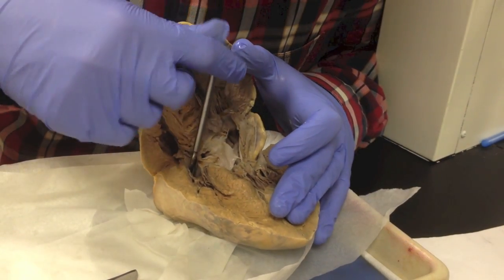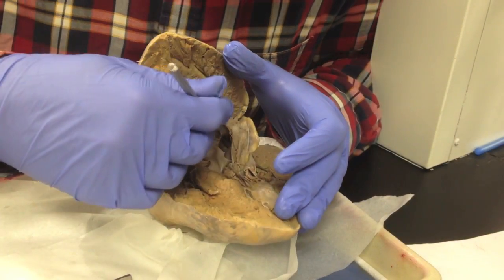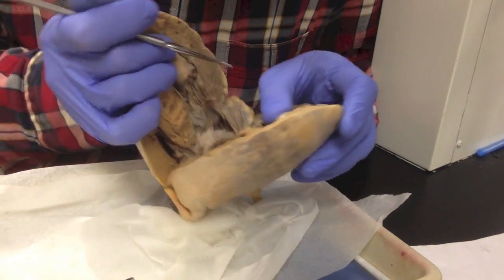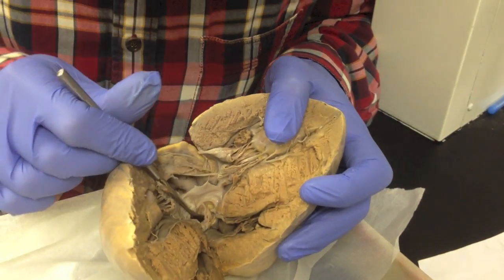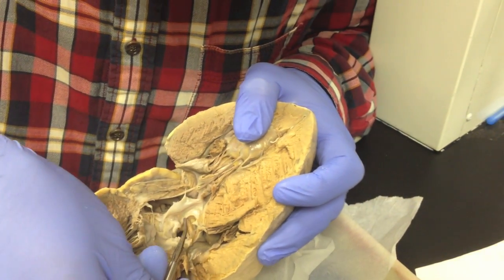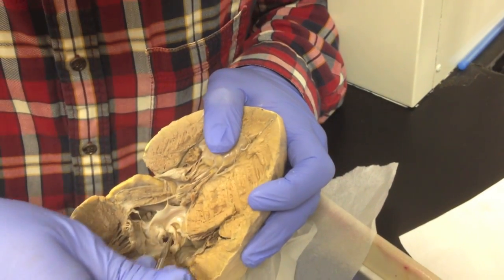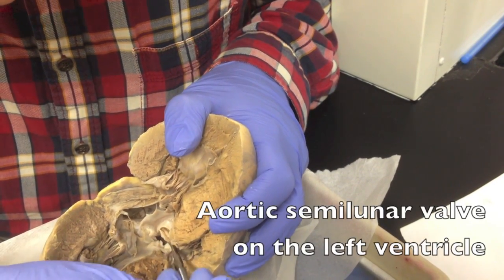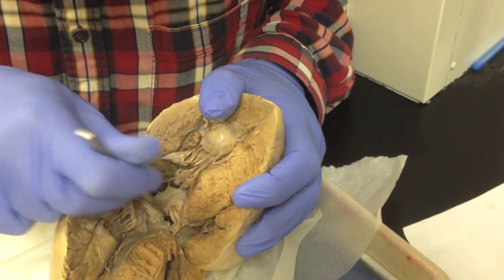The only thing left now is actually finding the semilunar valves. So I go into the left ventricle again and look at the very top — this is actually difficult to see — but you can see this structure here. It literally looks like the flanks of a butthole, and that's your semilunar valve — the aortic semilunar valve, because it's on the left side.